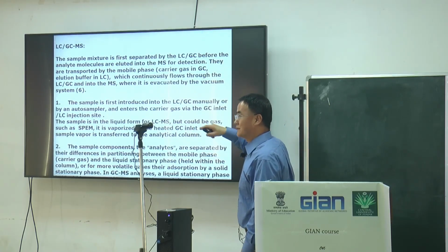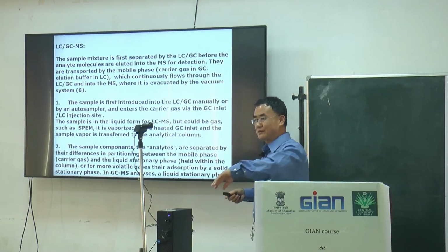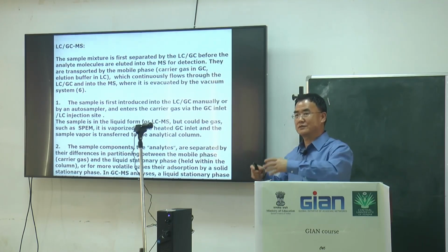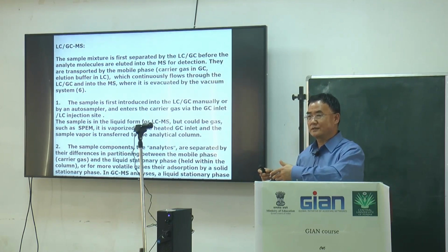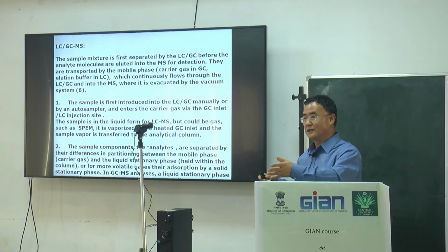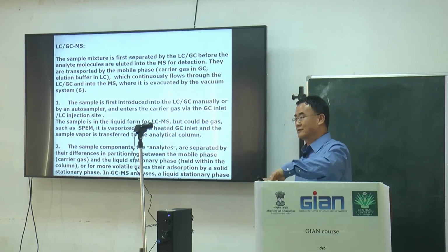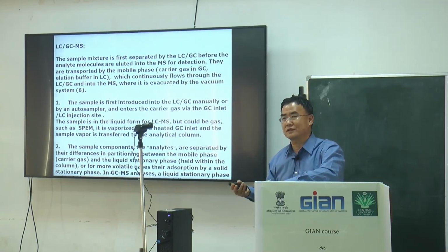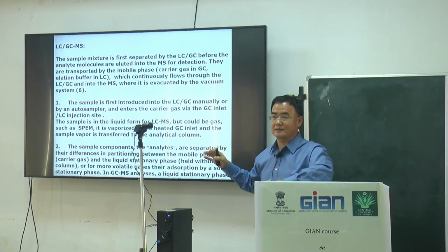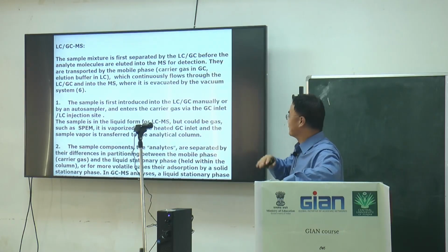Later on, when we measure with the mass spectrometer, we will cover how to maintain those, regularly washing the column at high temperature. High temperature is essential for sample evaporation. If your sample couldn't be evaporated, you couldn't analyze it. This is one of the limitations.